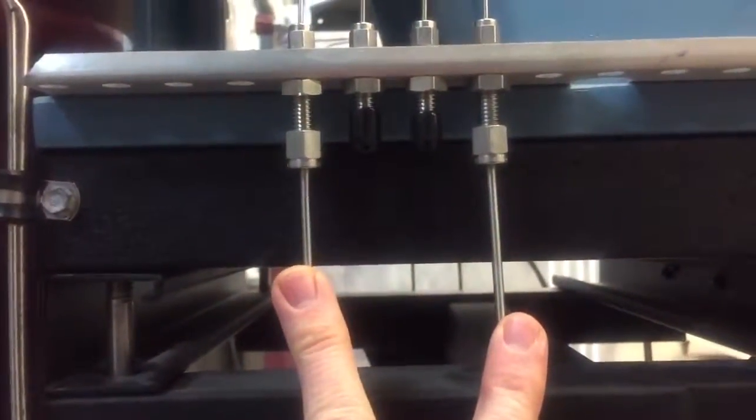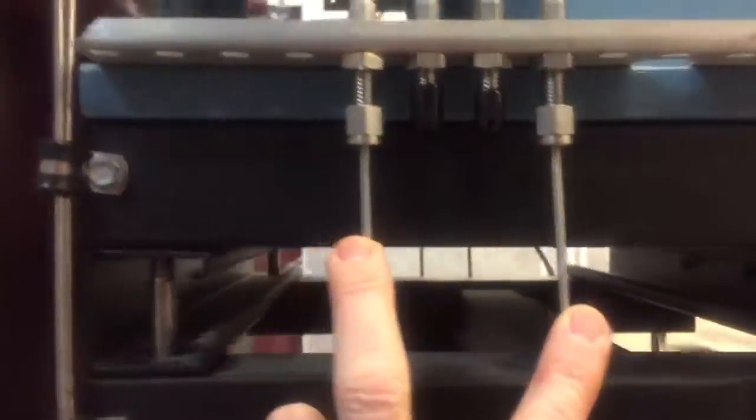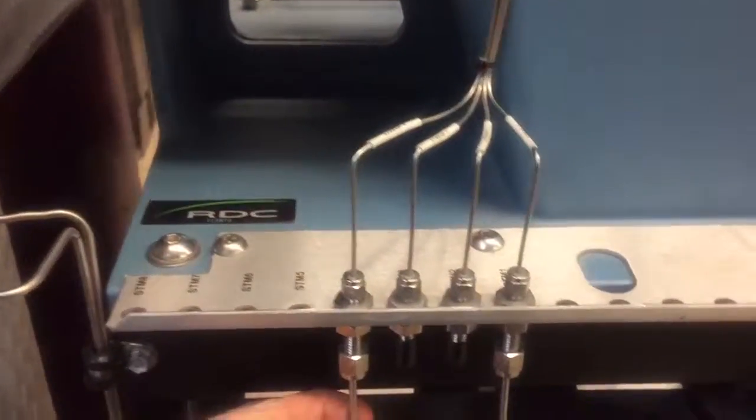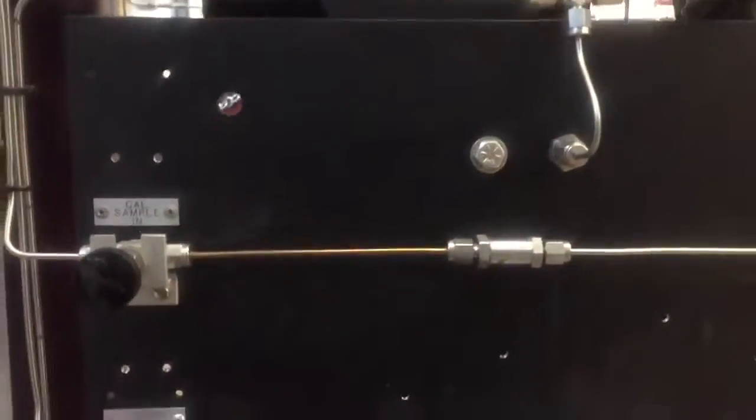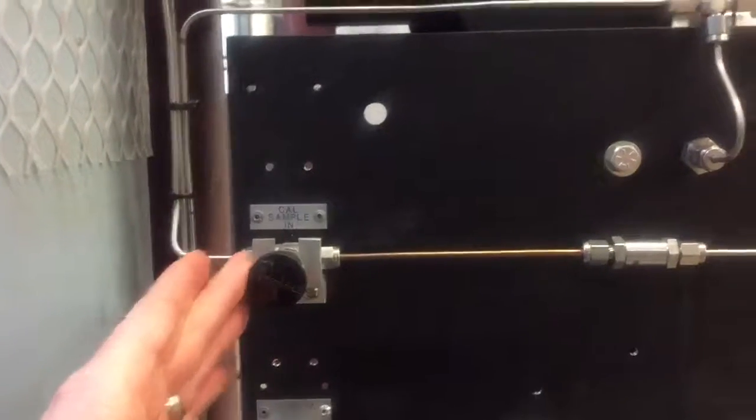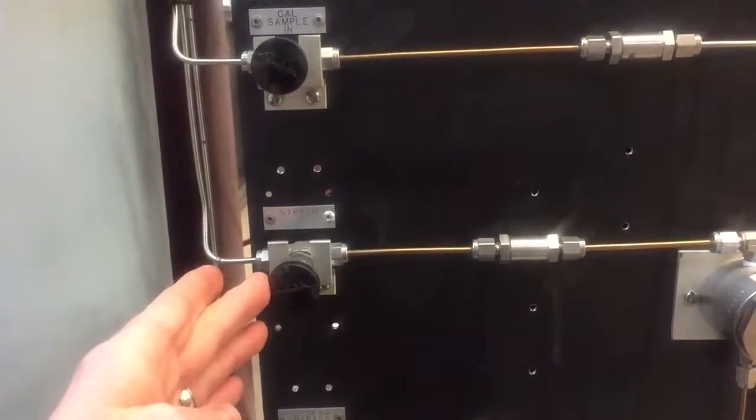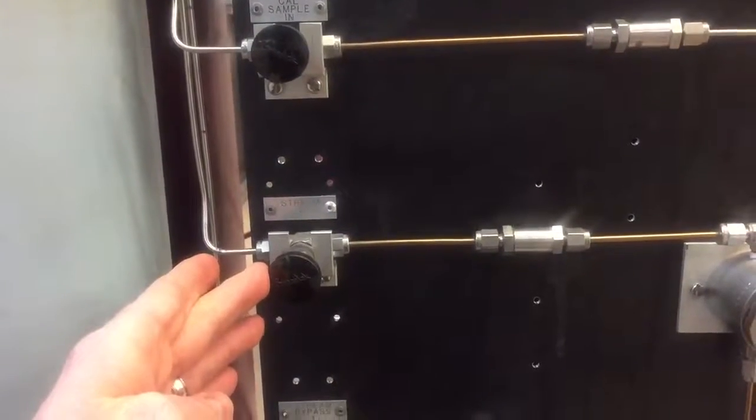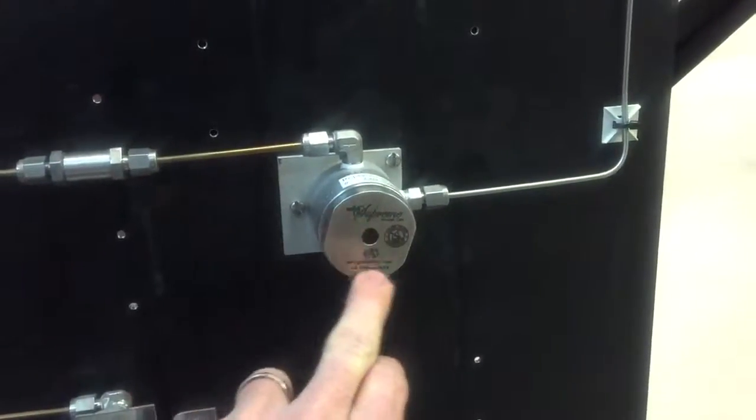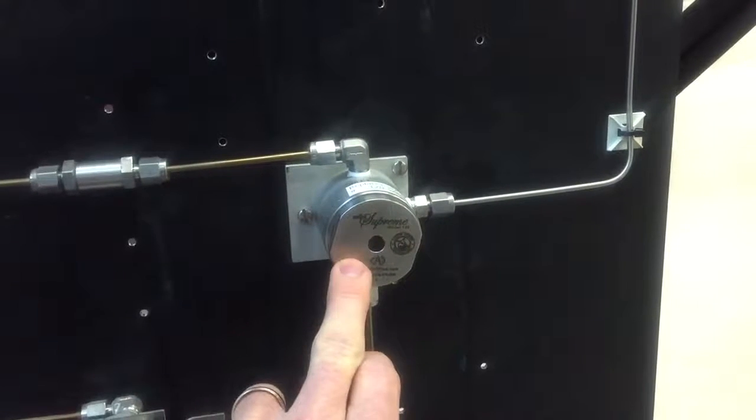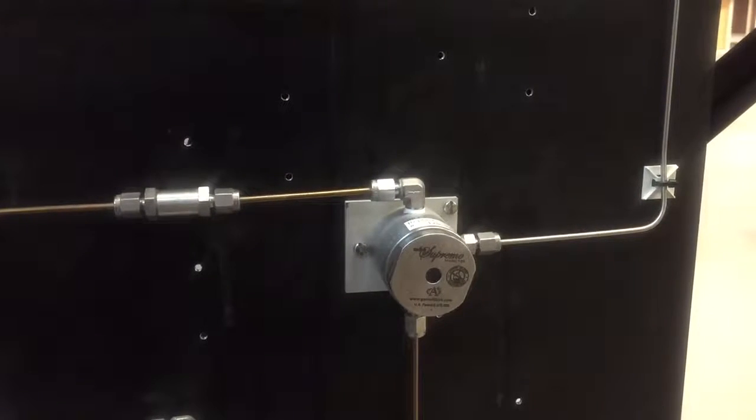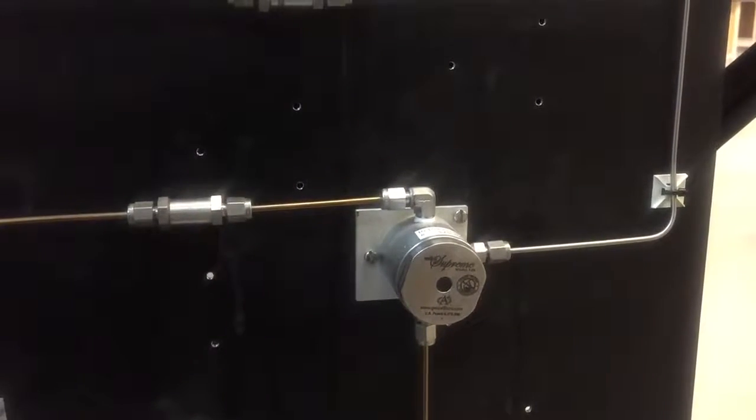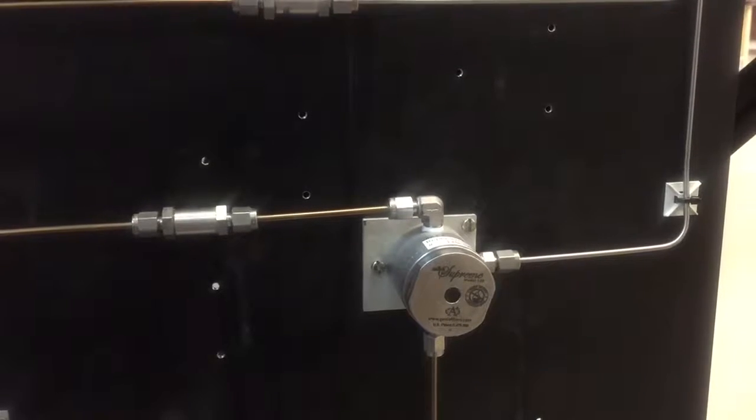There's only the two streams hooked up. We have one for the calibration gas here on stream four, and on stream one, this is for our live sample of natural gas. What you'll notice that's different between our cal sample in and our stream one where our natural gas flows in, they both have a check valve, but this guy has a G supreme filter to filter out any possible dust or dirt or anything that could get into our analyzer and chromatograph and cause issues. We want to protect it from that.